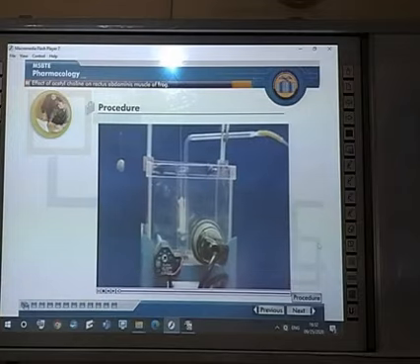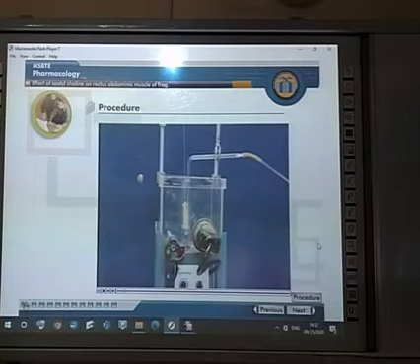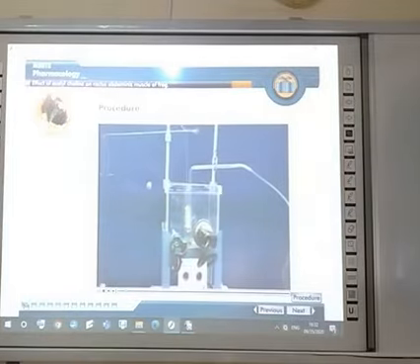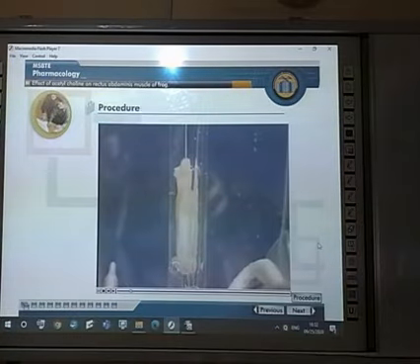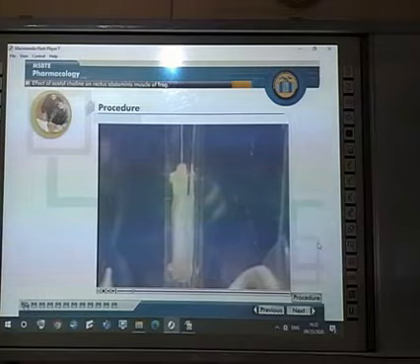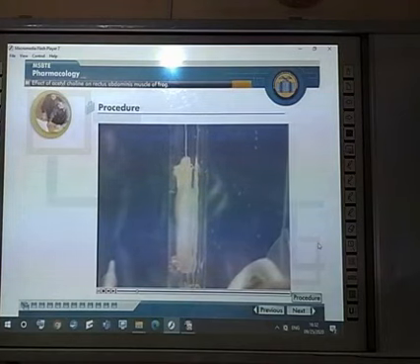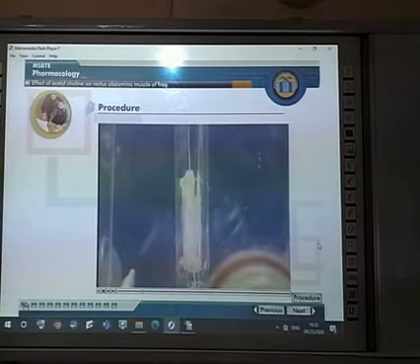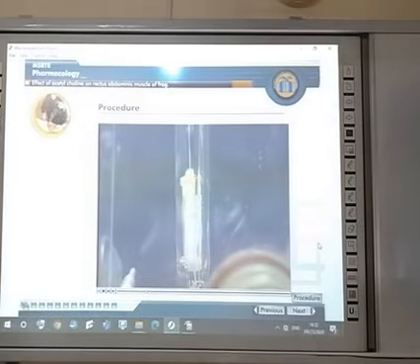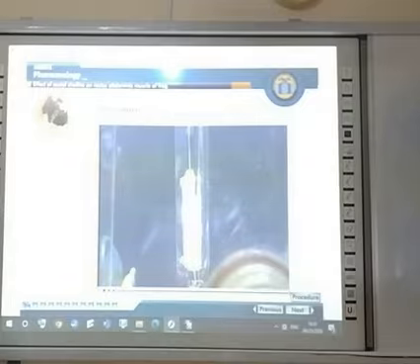We have already learned the isolation technique of frog's rectus abdominis muscle and the setup of the assembly. Now stabilize the mounted muscle preparation for 45 minutes in frog Ringer solution. During this period, wash the muscle preparation with a fresh quantity of frog Ringer at least 4 times.